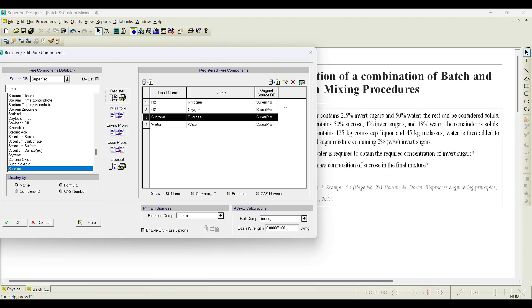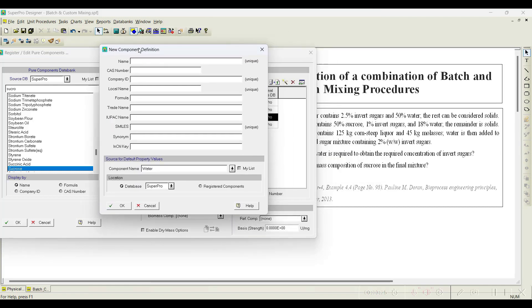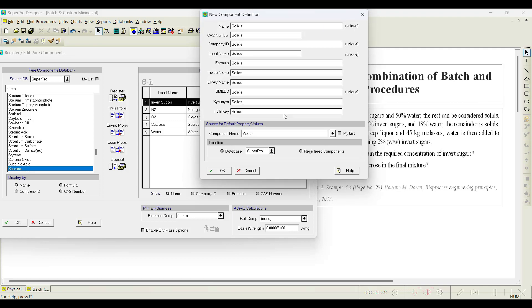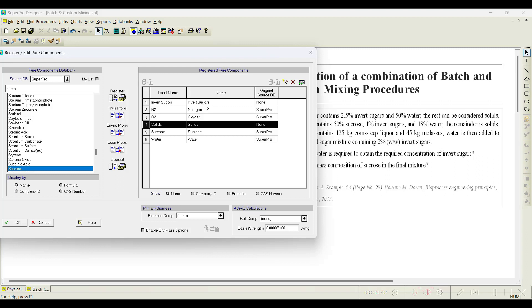We do not need to add all the physicochemical properties because we are going to simulate on a mass basis — no conversion to moles or other units. So we just register them as new components and assign the water properties to them. I will register invert sugars and click OK with the default water properties, then register one more component called 'solids' and click OK. Now all required components — invert sugar, water, solids, and sucrose — are registered.